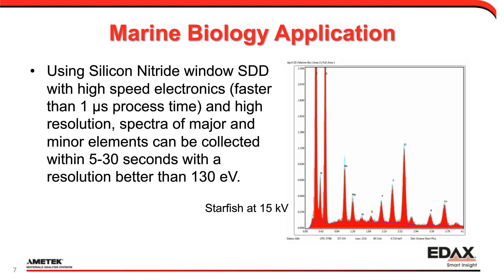Using the same detector, we're able to collect a spectrum of major and minor elements within about 30 seconds. And so in this case, we have some real trace elements below 2 to 5%, and we're able to collect the spectrum and get our data very quickly from it. What's notable is the sodium and chlorine, and that tells us that we have obviously salt somewhere in our sample.